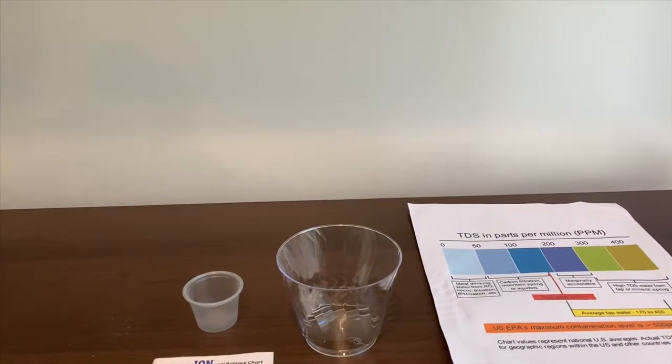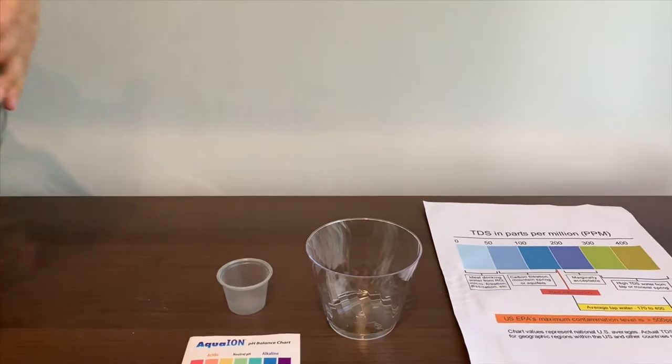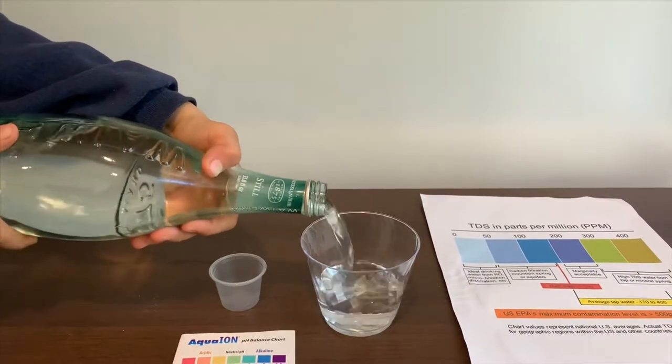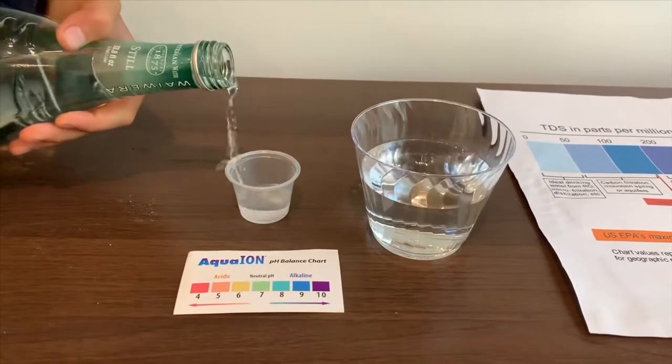Let's open it up. Let's pour some water in, and let's not put too much in the TDS cup.